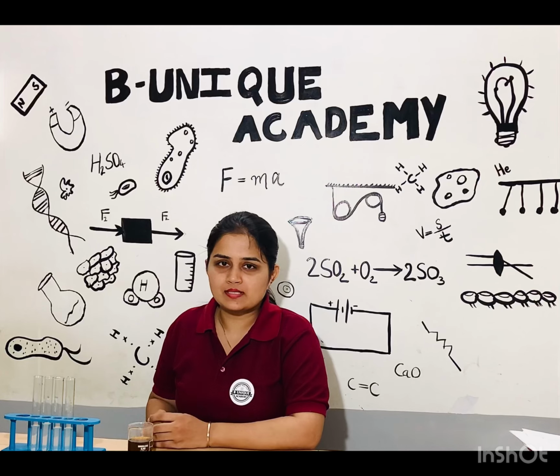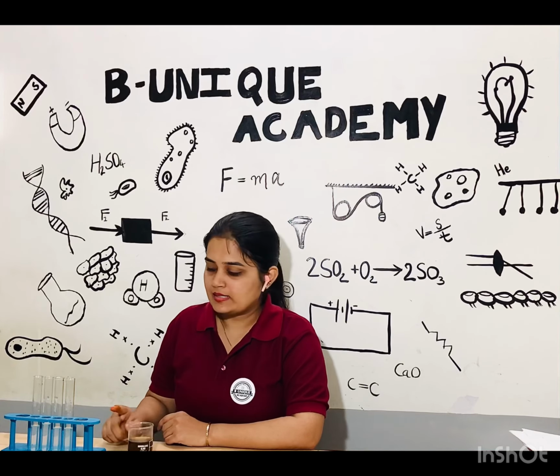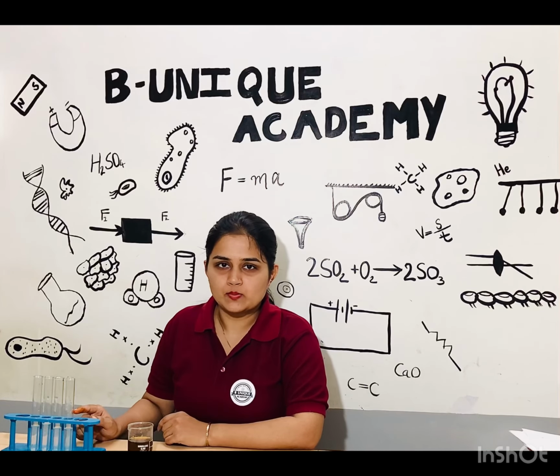Here in apparatus I have a beaker full of colored solution. You can take solution of any color like orange, red, etc., or you can take a chemical like potassium permanganate, which will give purple color solution. Test tube stand, 4 test tubes.